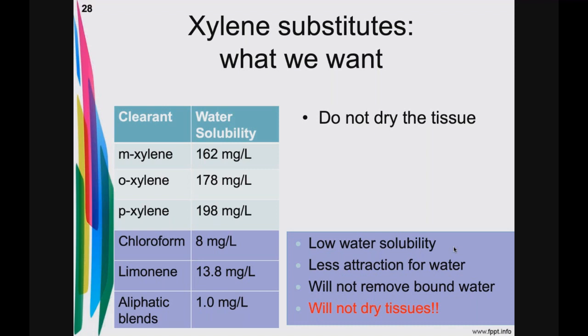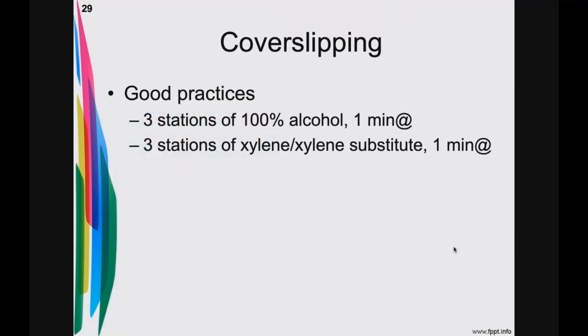They won't dry out. The xylene substitutes will not dry out your tissue. They've got the solubility for lipids, so they can dissolve the lipids, but they need more time because they're not that super duper of a lipid solubility. They need more time. They can do it, but that's okay. They can sit in there and do it because while they're sitting in there, they're not drying out the tissue. They literally are just dissolving out the lipid molecule. So we've got that advantage now, the xylene substitutes. They don't dry out your tissues.